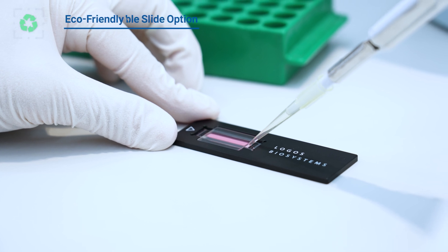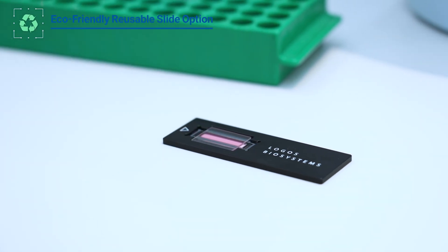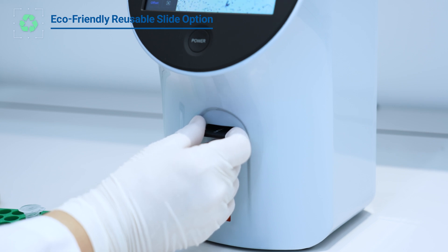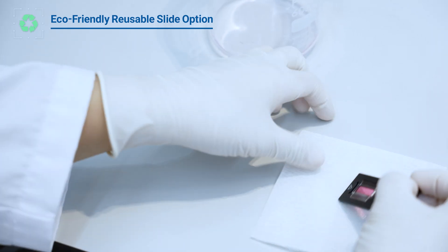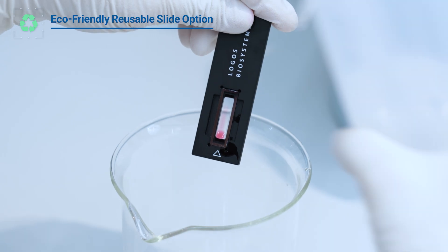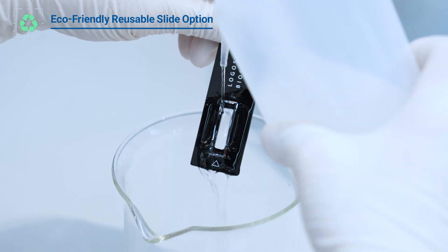Our eco-friendly reusable slides are designed to reduce plastic waste and provide long-term use, offering sustainable solutions that are also budget-friendly. Disposable slides can also be used for added convenience and easy cleanup to increase precision in the cell count.